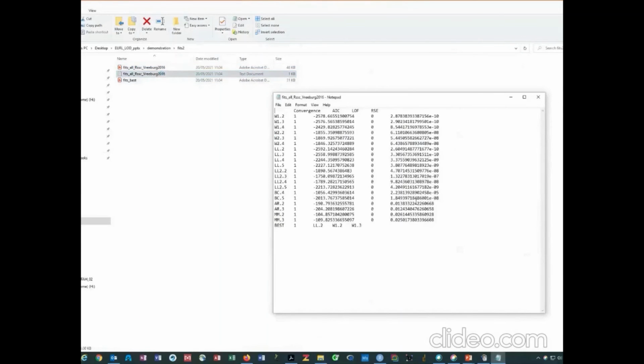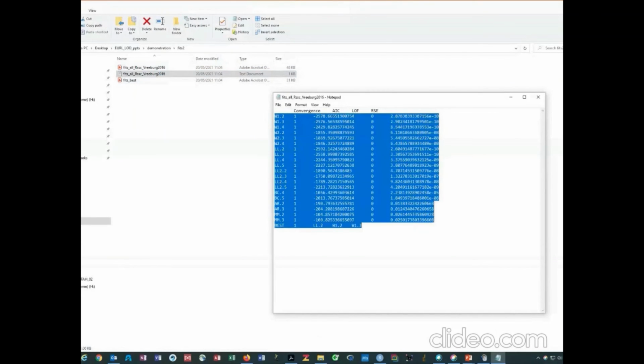Then we have this sort of data for different models. This last number is the residual error. So the higher the residual error, the worse the fit. So you want a model that has low residual error. Basically, you are deciding what is the best model mainly on the residual error, and just looking at it, seeing whether it fits or not.